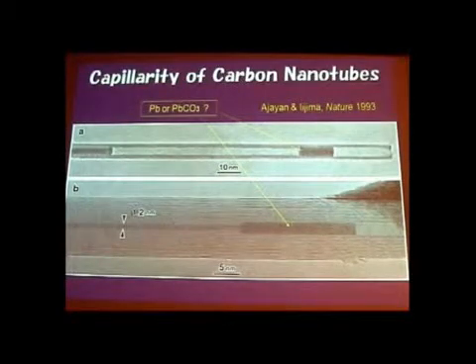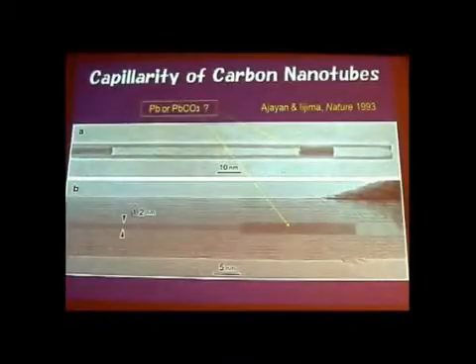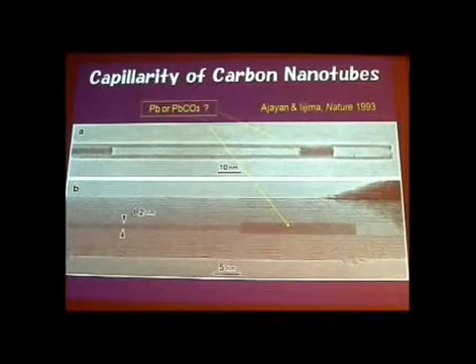Okay, now I'm coming to another subject. So we have the carbon nanotube, and at the center we have empty space. So there we can put many things. This one, I believe, is the first report, with the multiple carbon nanotube. We have this case, lead or maybe lead carbonate. So we can fill the central part of the carbon nanotube with some material.